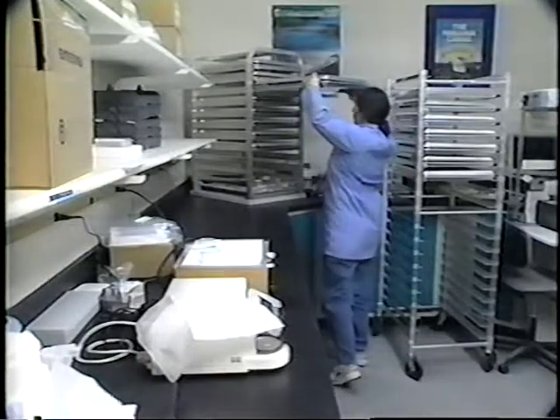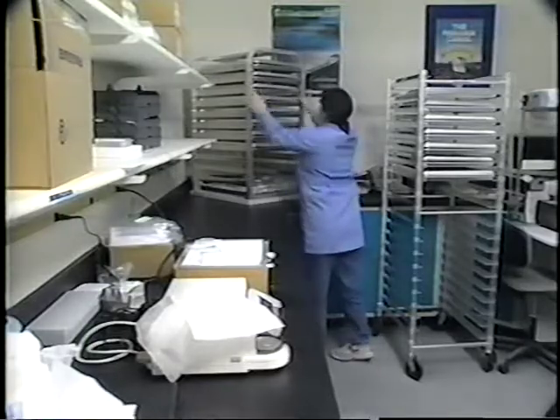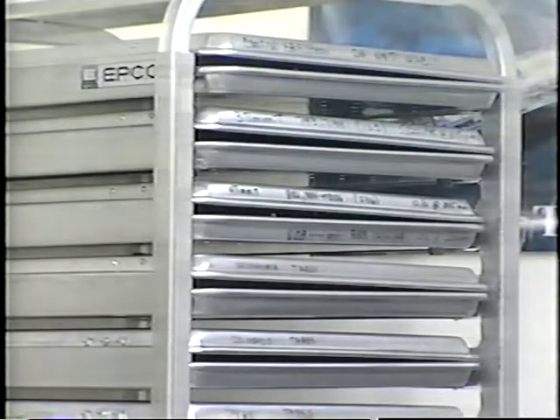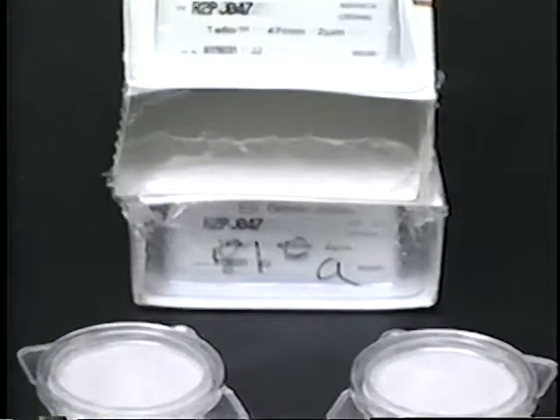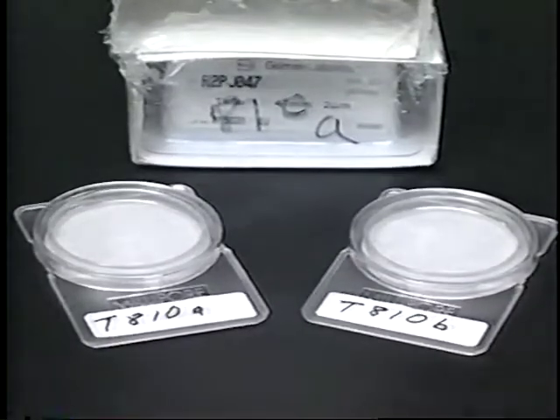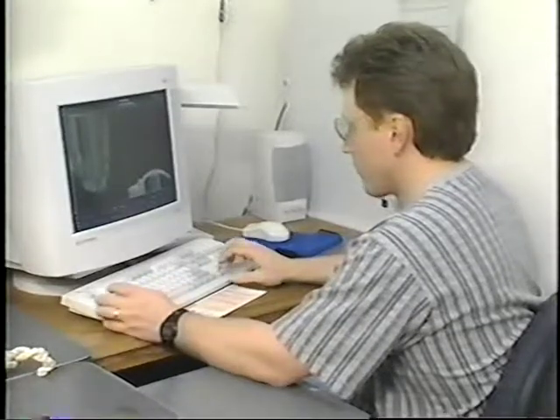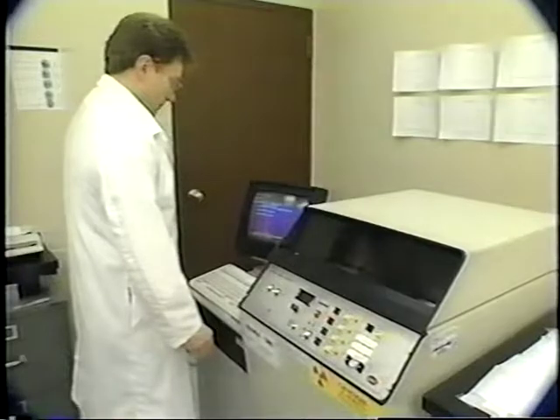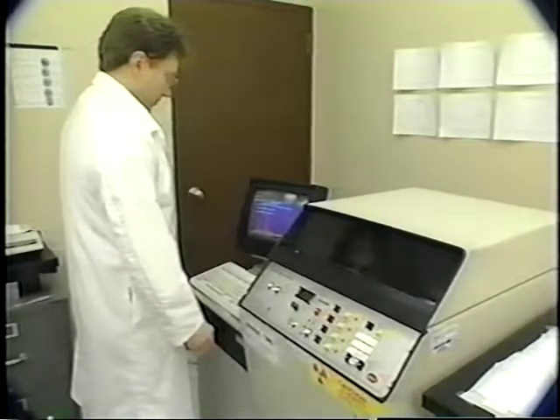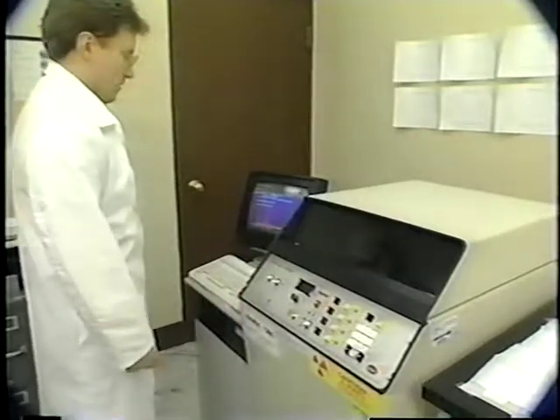Most filters require prior treatment and acceptance testing of chemical background levels when the deposits they acquire are intended for chemical speciation. At least 2 filters from each lot of 100, or a minimum of 2% of filters purchased from a specified manufacturer, should be analyzed for all species to verify that pre-established specifications have been met. Lots are rejected for chemical analysis when blank levels for individual species exceed 1 microgram per 47 millimeter diameter filter.